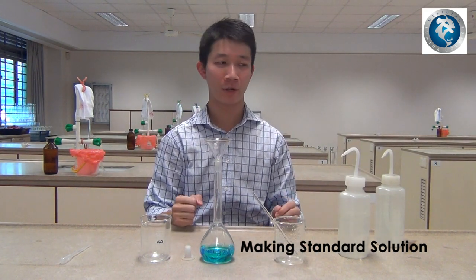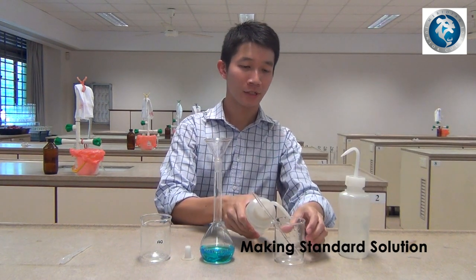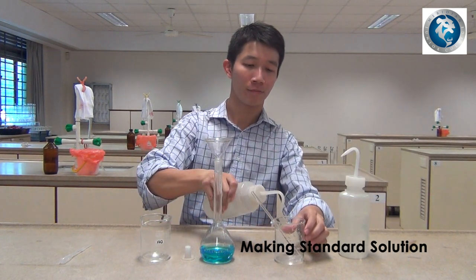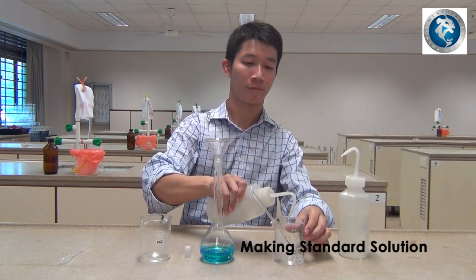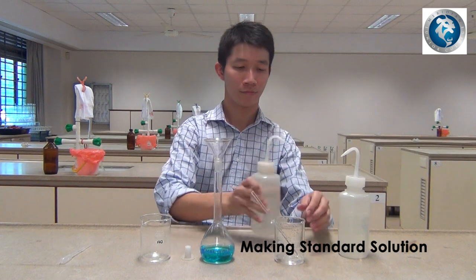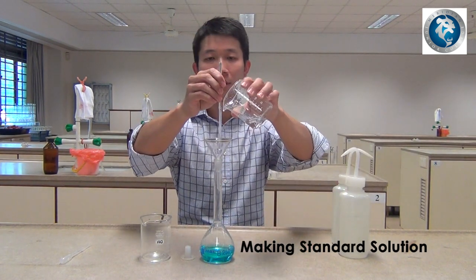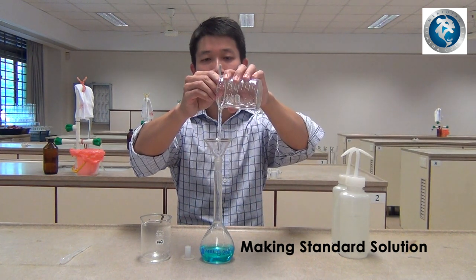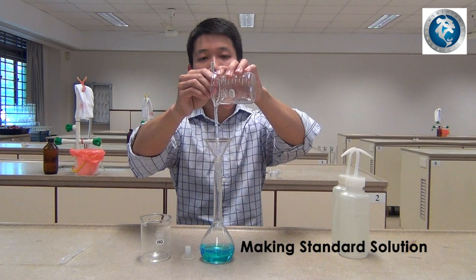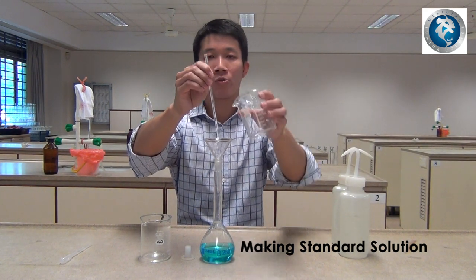After you are done with the pouring, use the de-ionized water to rinse the side walls of the beaker, and pour the de-ionized water using the glass rod as a guide back into the volumetric flask. Do this twice.